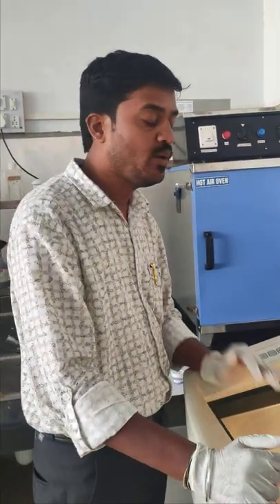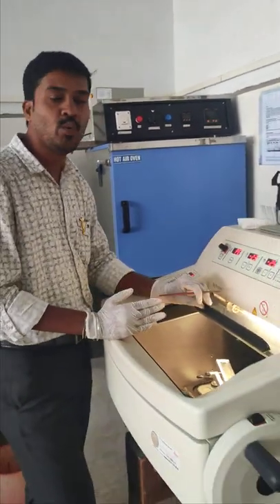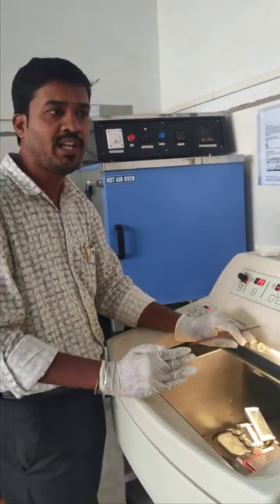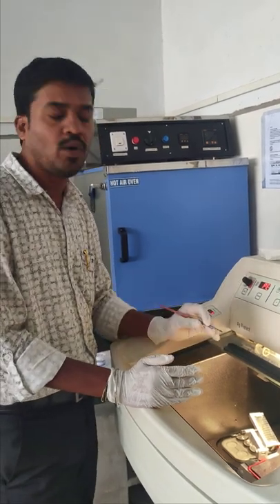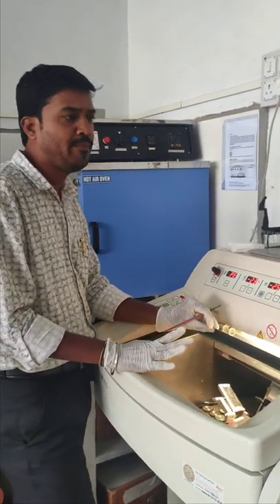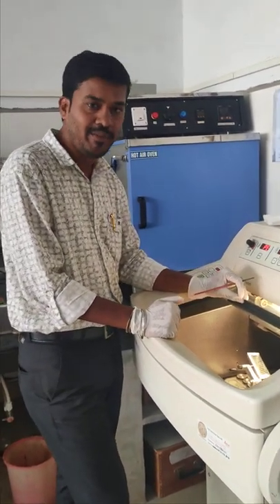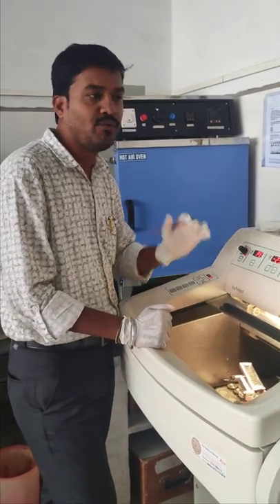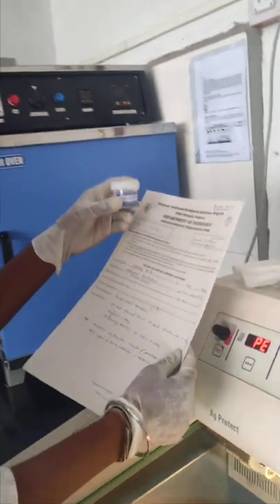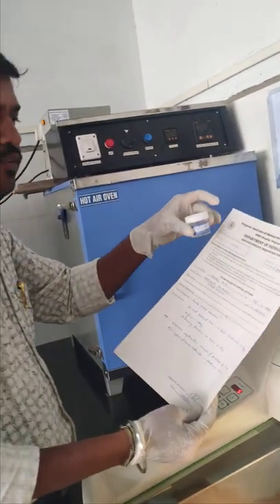Why do we perform frozen sections? In emergency situations, instead of doing paraffin sections, we cut blocks in the cryostat. When a patient is in the operation theater and the surgeon suspects any kind of malignancy or abnormality, they will immediately suggest a frozen section and call the pathologist to perform it. The fresh tissue is sent immediately to the histopathology laboratory for frozen section.